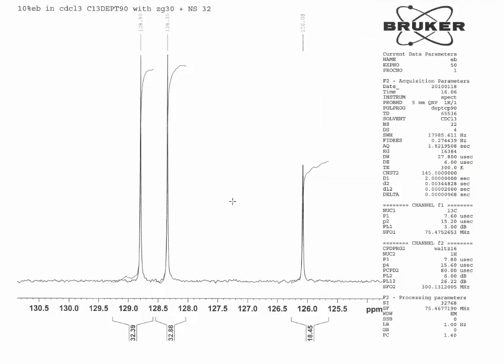So as we're looking at it right now, this is the normal CPD spectrum, the single peak for each carbon. If we want to look at how they get split up, I'm going to advance to the next frame. And you're going to see for each of these peaks, things get broken apart. So we've got a peak here, a peak here, and a peak at 126. Now take a look at this. I'm going to advance the slide and see the J resolved on top.